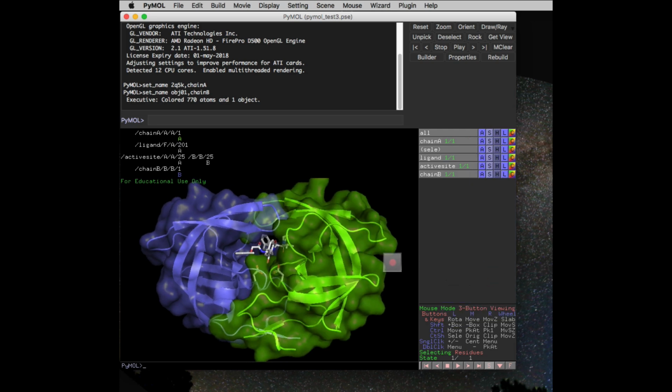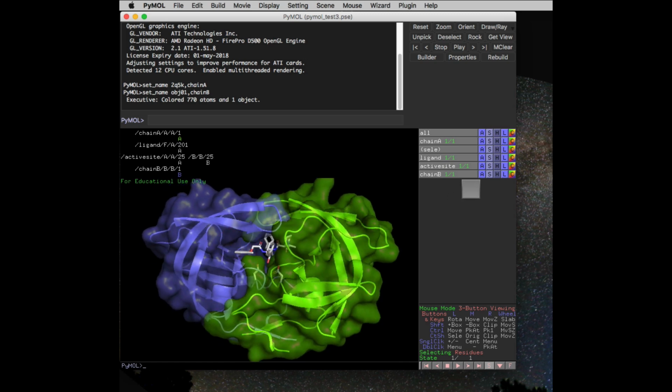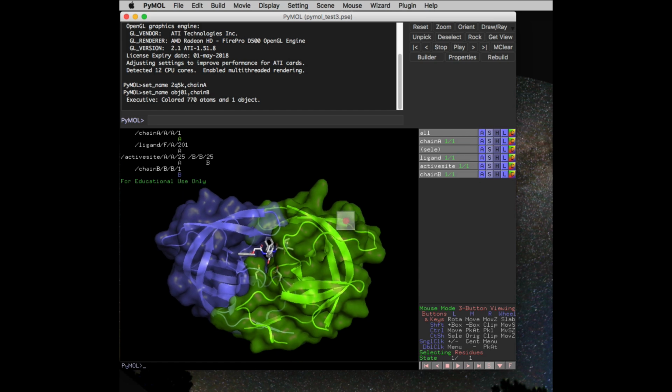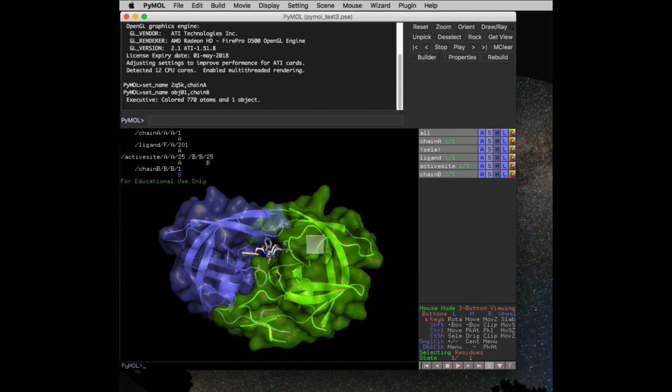The reason we want to do this for individual chains is that the surface is contiguous and in separate colors. That can be pretty powerful. Now we can recenter and orient it the way we like. So if we undisplay one of the monomers, we'll be able to see the contiguous surface of the other without disruption.